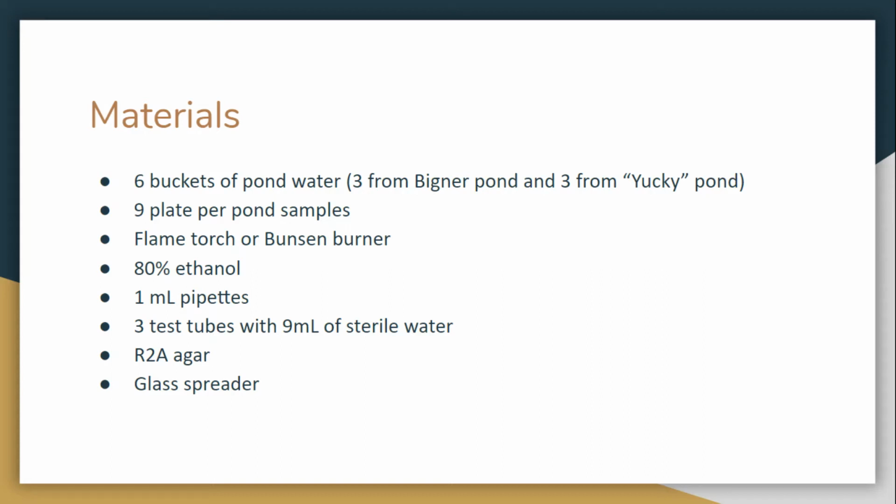R2A agar is a culture medium developed to study bacteria from potable water in a laboratory setting. These bacteria tend to be slow-growing species and would quickly be suppressed by fast-growing species on a richer culture medium.